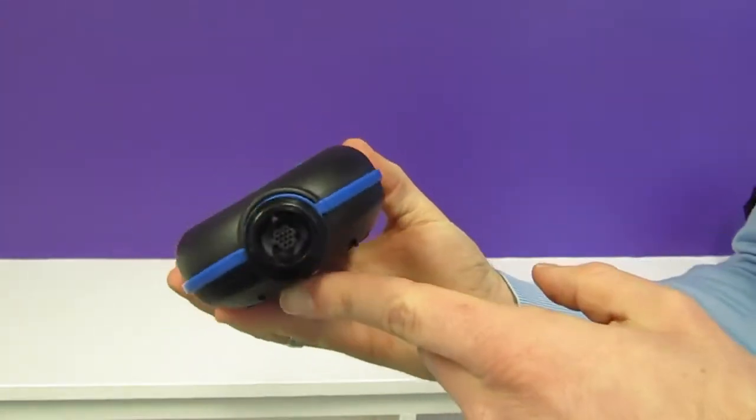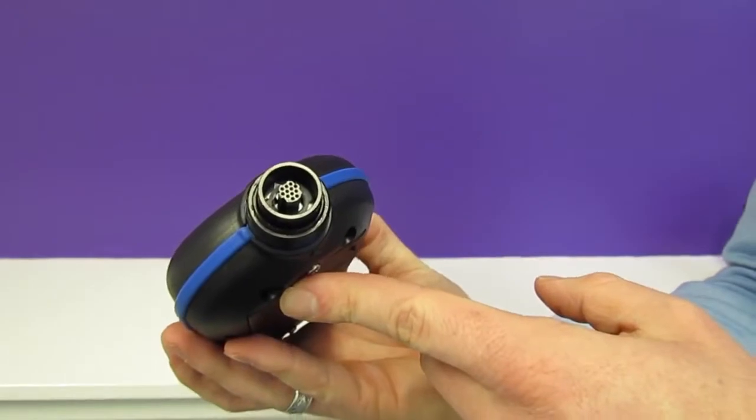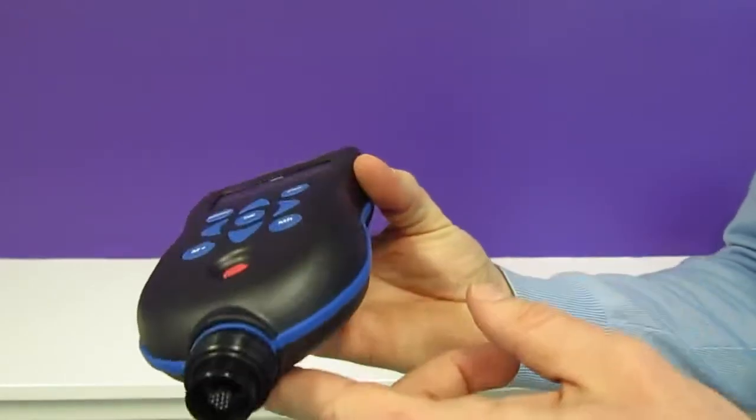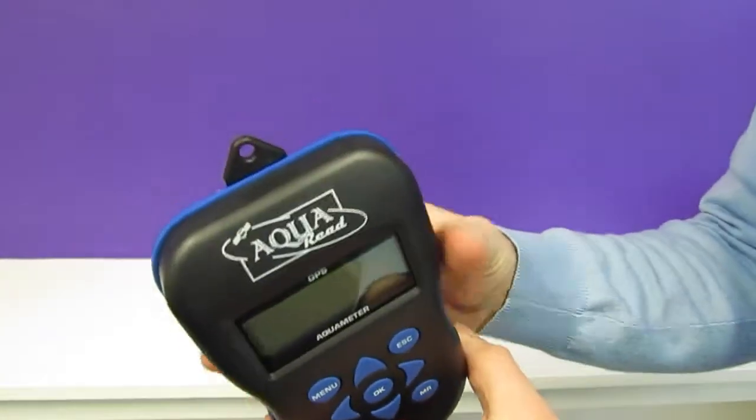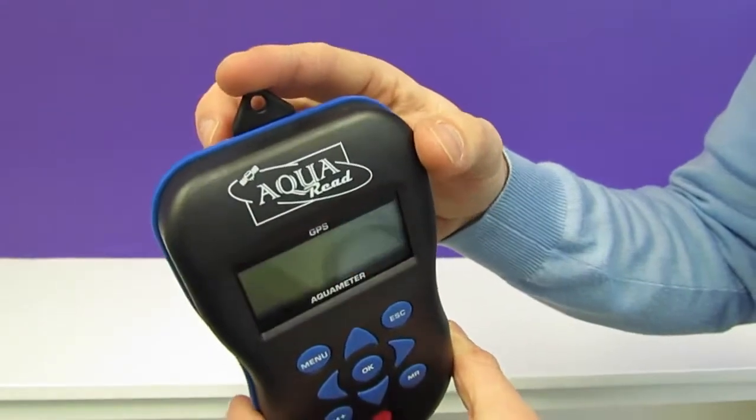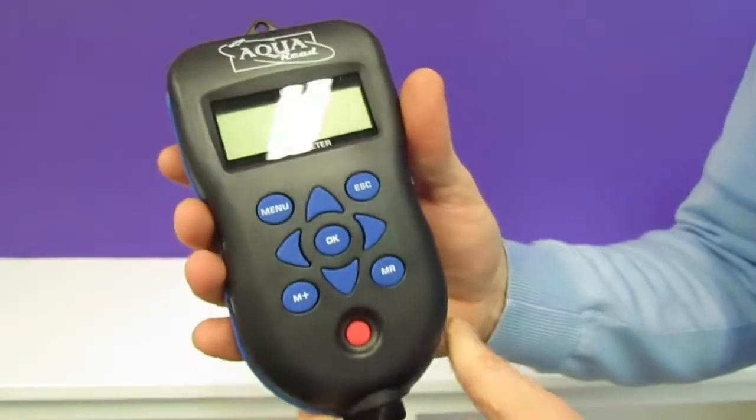The meter also features one of our metal connectors which is very strong and rugged for use in the field. And it also has a lanyard clip to allow you to fasten the meter around your neck so you don't drop it into the river.